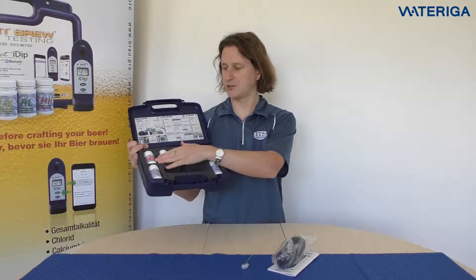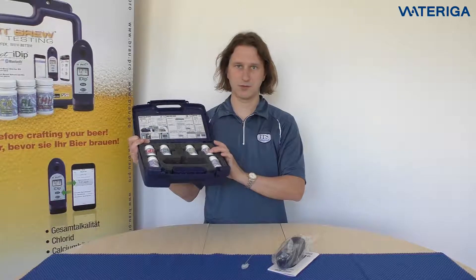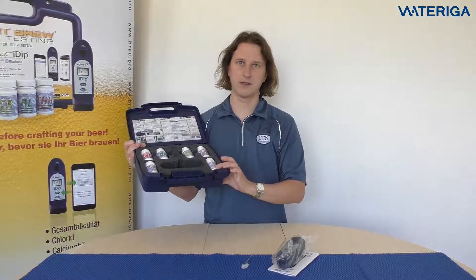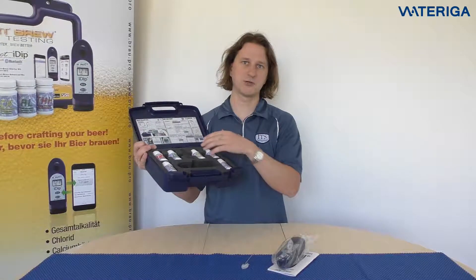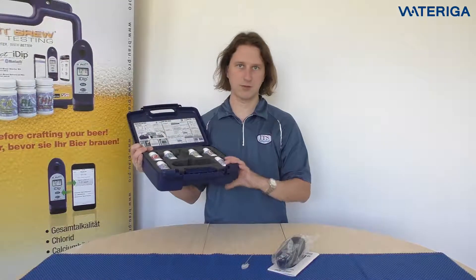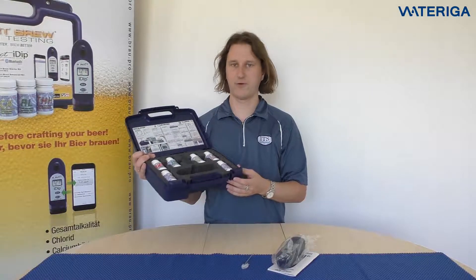And then six reagents: sulfate, pH, alkalinity, calcium hardness, total hardness, and chloride. When you do all these six tests, you also get residual alkalinity, sodium, and magnesium hardness calculated in the app for free.